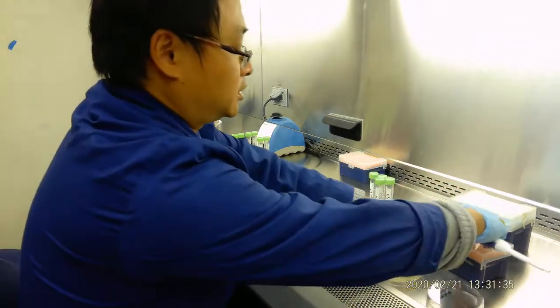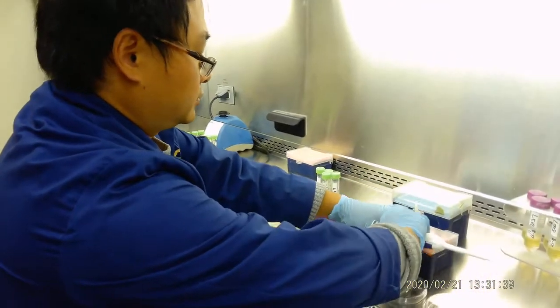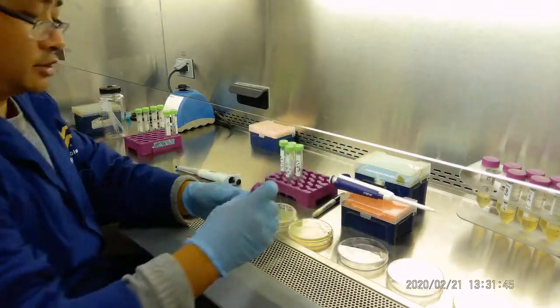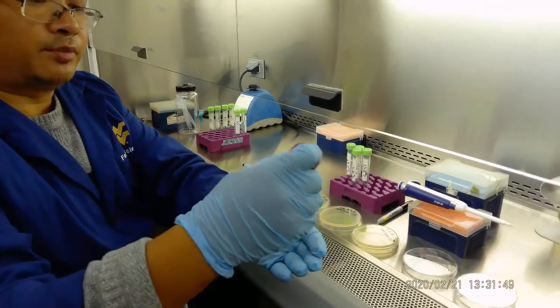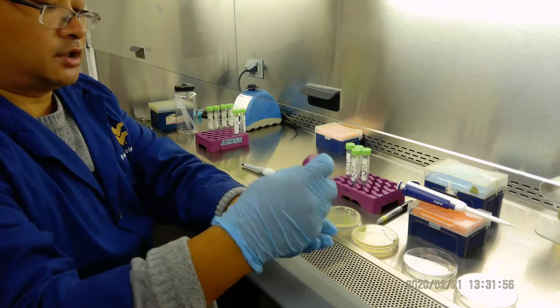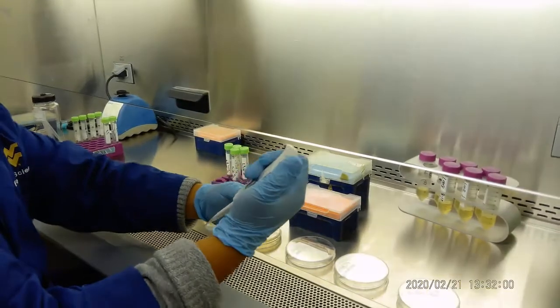Okay, so let's do a serial dilution. First of all, we will make sure these are shaken, because in the lab we will just do shaking. Take a picture of whatever I'm doing here. For the bacteria, we're doing the shaking. Make sure you shake it. So we're going to carry on the bacteria from here.